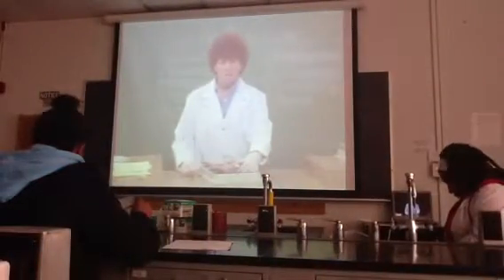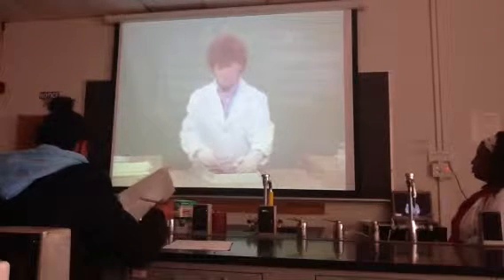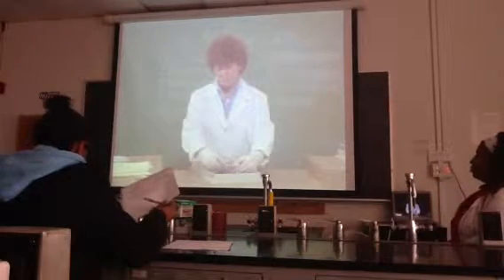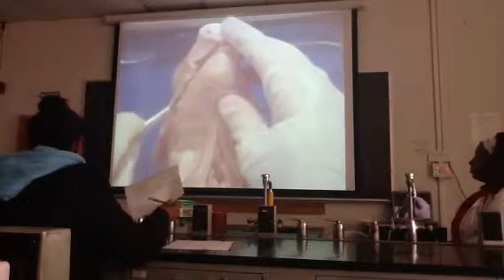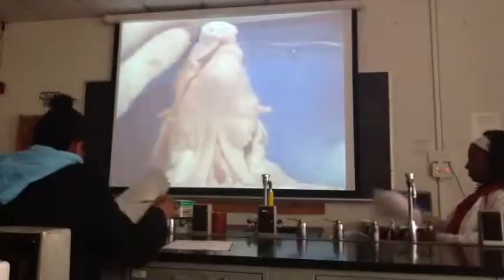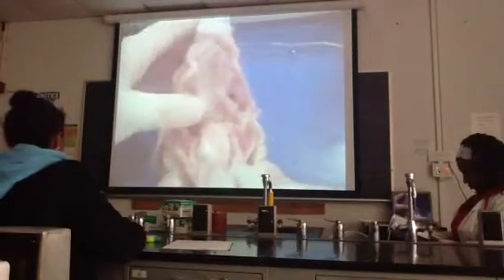We're now ready to begin the study of the mouth cavity. To expose the mouth structures, make a slit in each corner of the mouth. Then, drop the lower jaw to expose the mouth structures. This is so freaking disgusting.